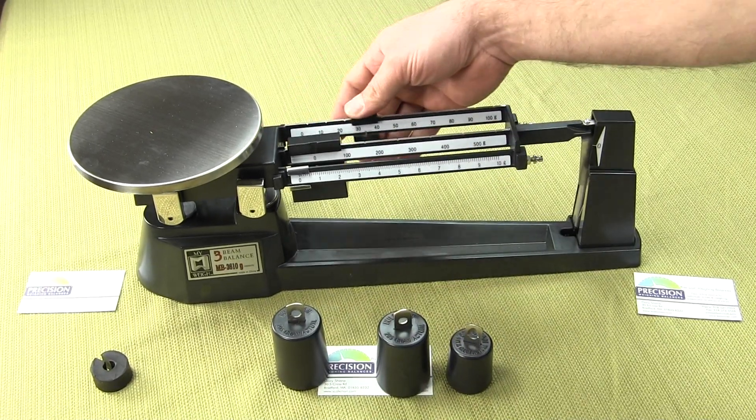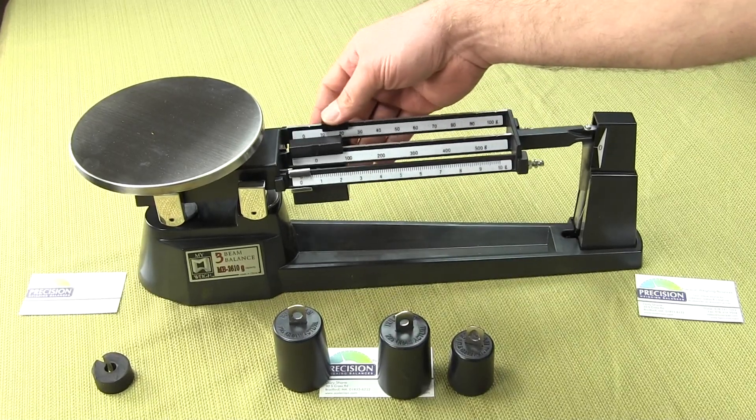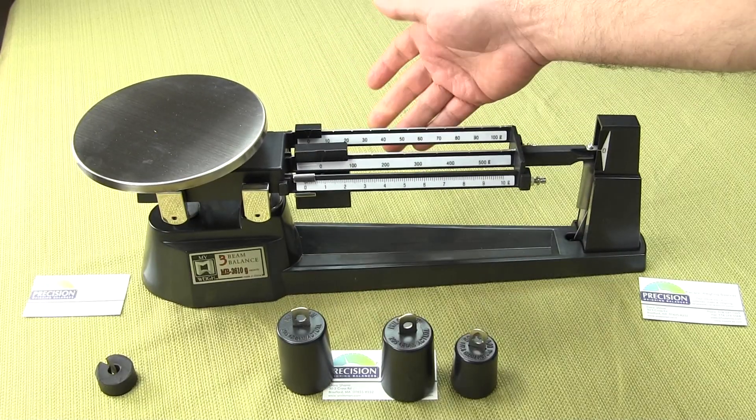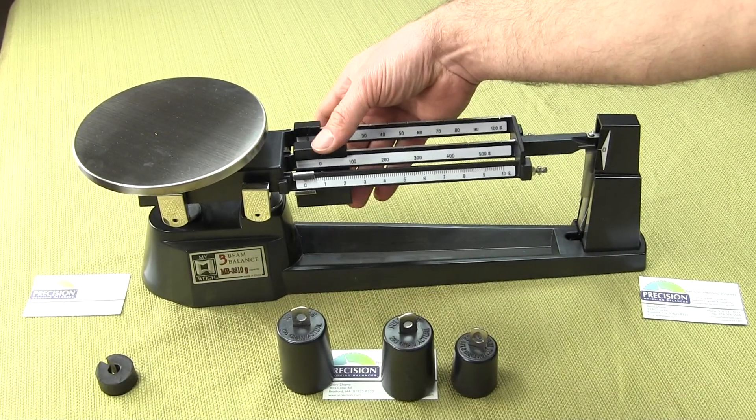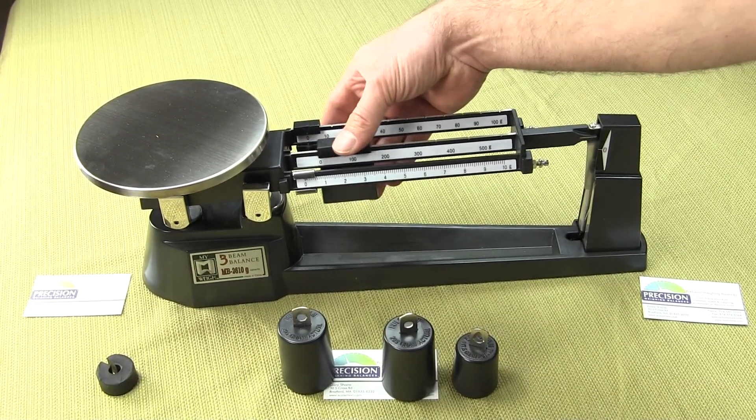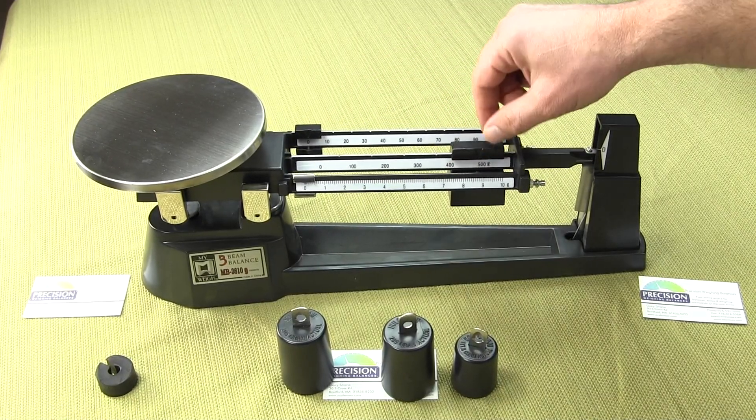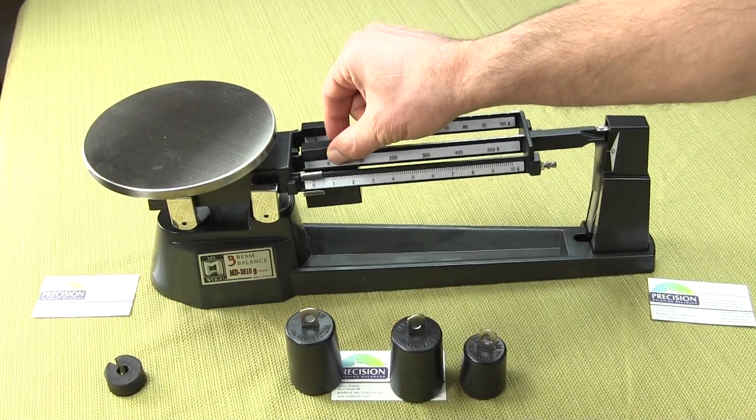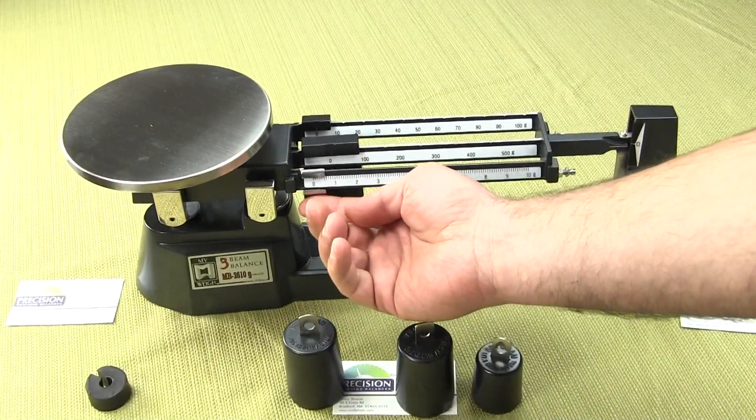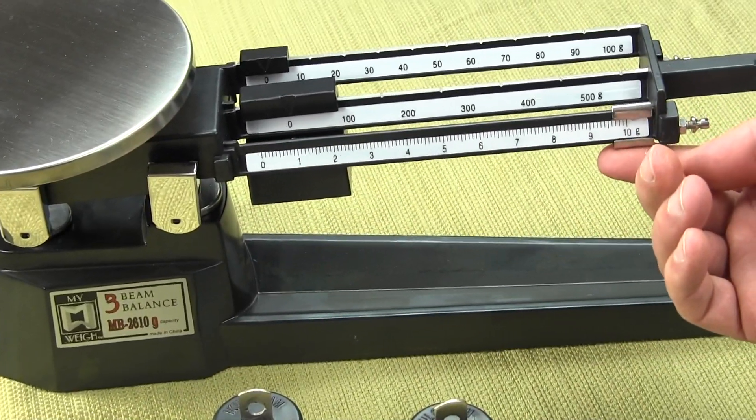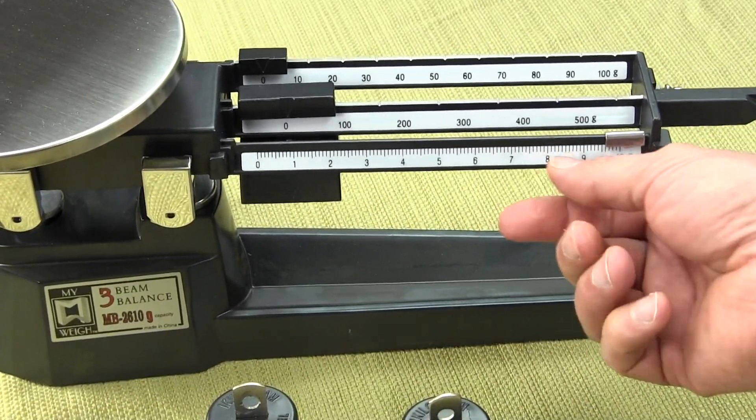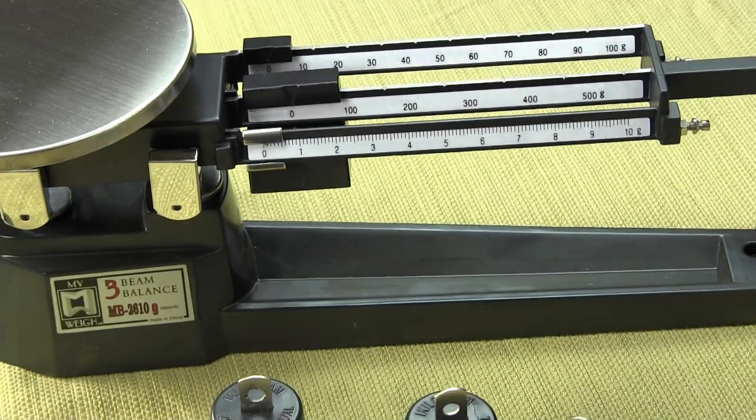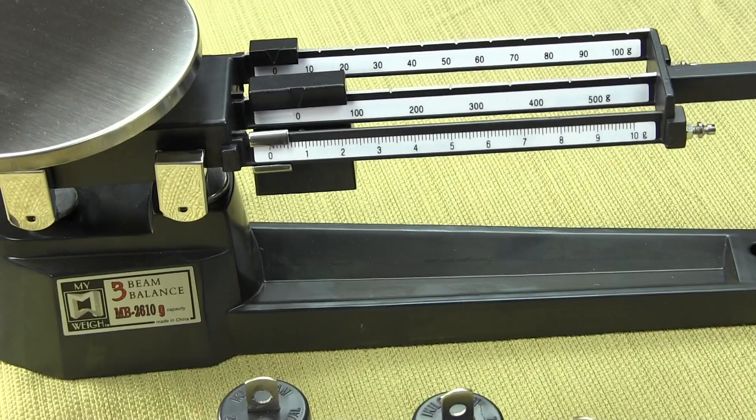In the rear, this beam goes in 10 gram graduations from 0 to 100 grams. The center beam goes from 0 to 500 grams. These pieces of metal here are called riders. The front beam or third beam goes from 0 to 10 grams in a tenth of a gram graduation. When you're weighing an object, we'll be adding all of these beams up.